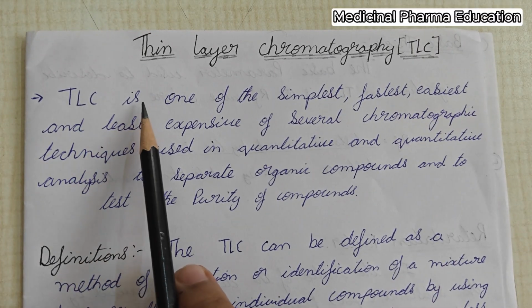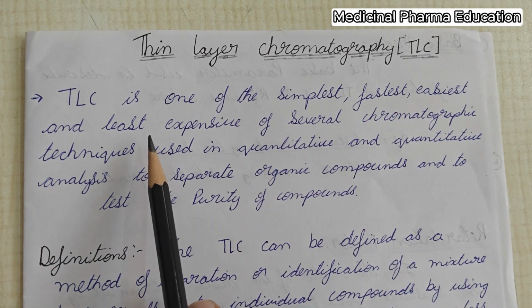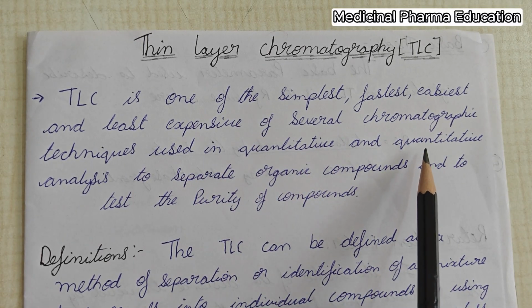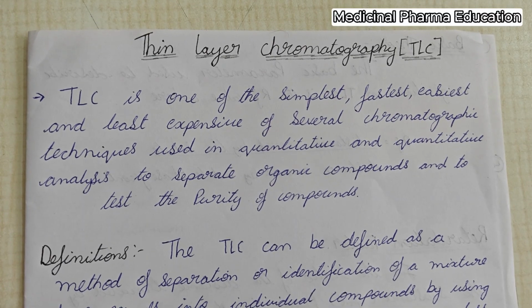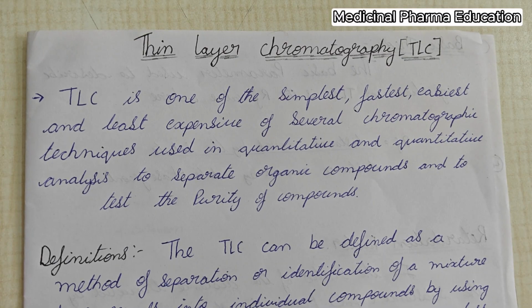TLC is one of the simplest, fastest, easiest, and least expensive of several chromatographic techniques used in qualitative and quantitative analysis to separate organic compounds and to test the purity of compounds. It is used for both qualitative and quantitative analysis, for separation of organic compounds, and for purification.